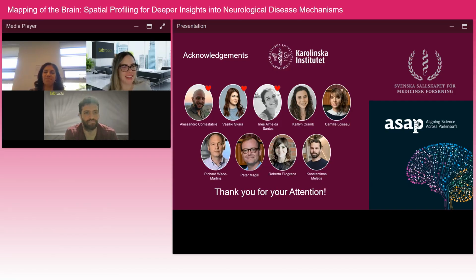Okay, fantastic. The next question that we have here says, does MERFISH 2.0 use different probes for different RNAs simultaneously?